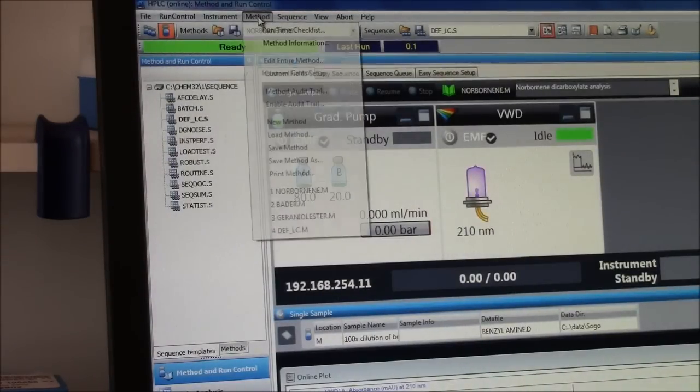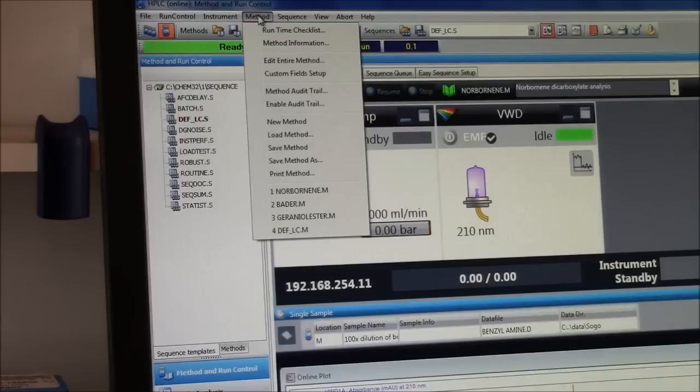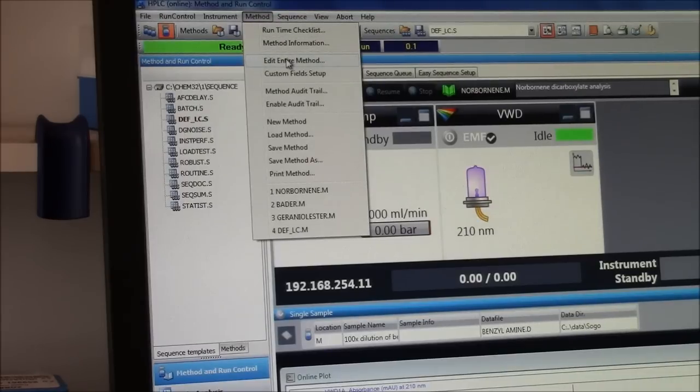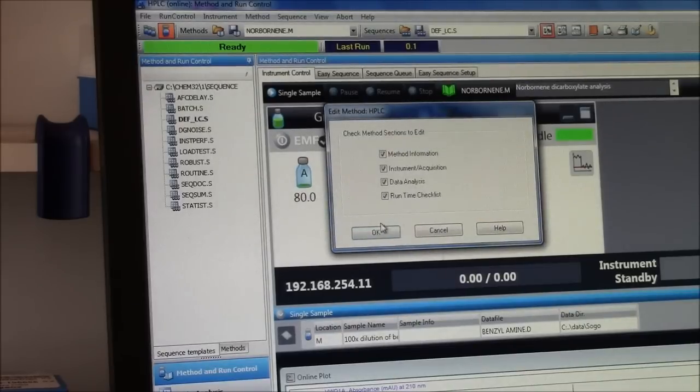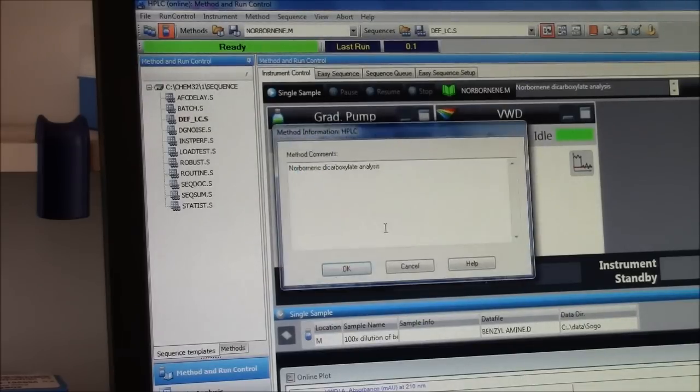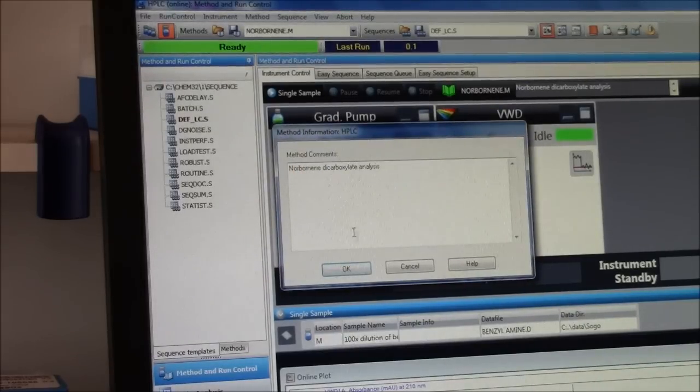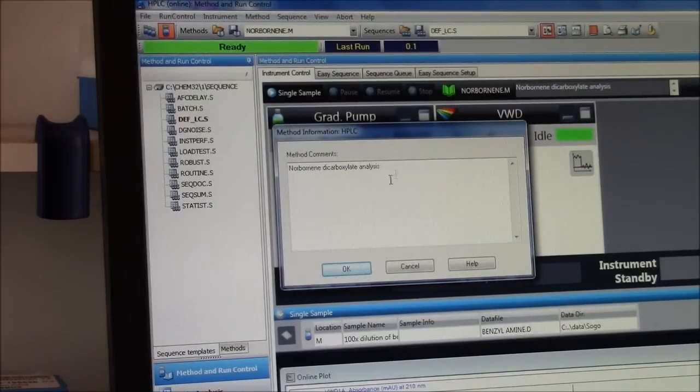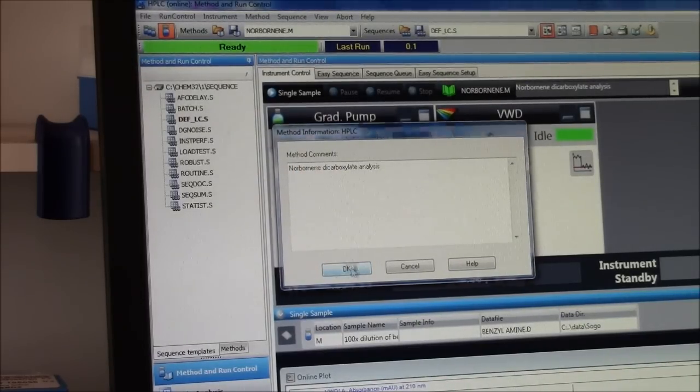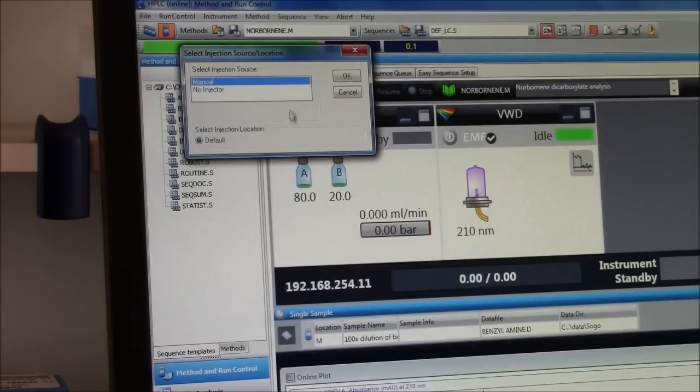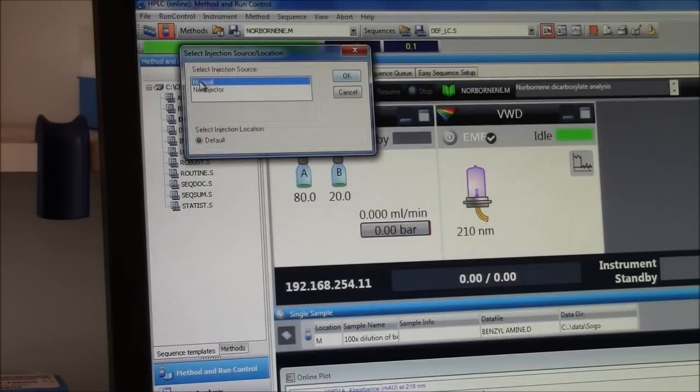If I want to change the method, I go to edit entire method. This has a comment, tells what it is good for. Manual injection.